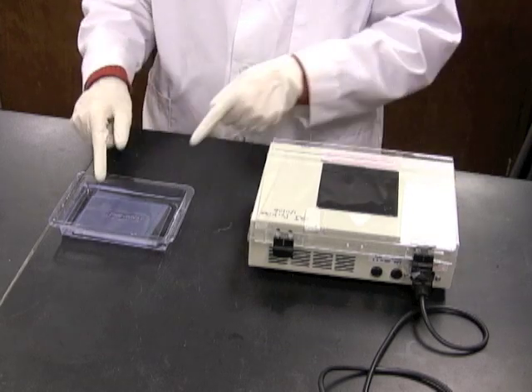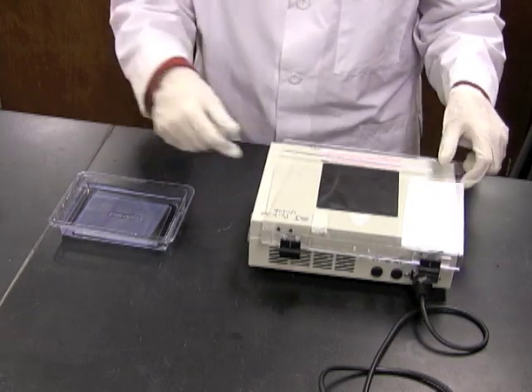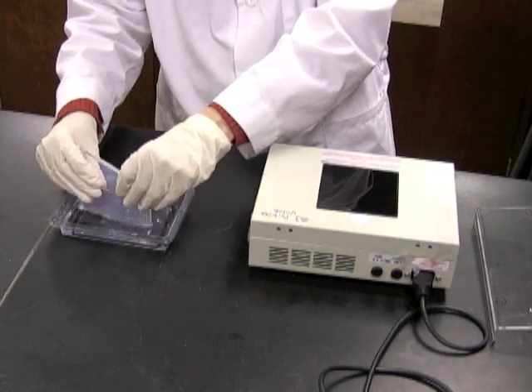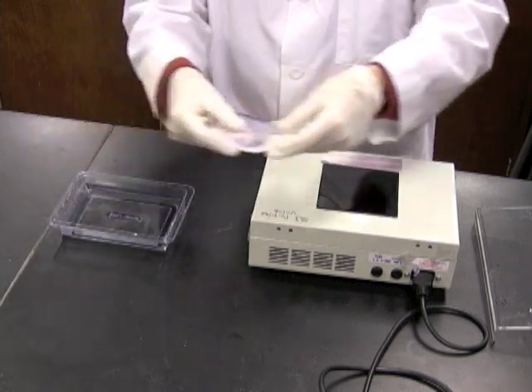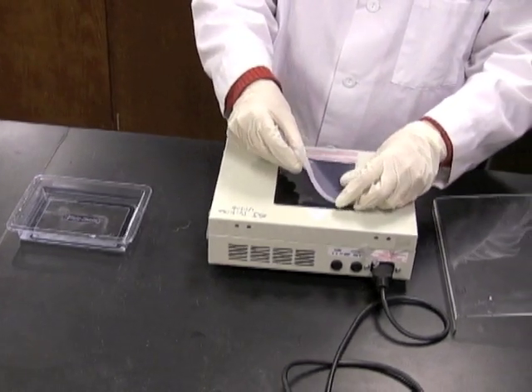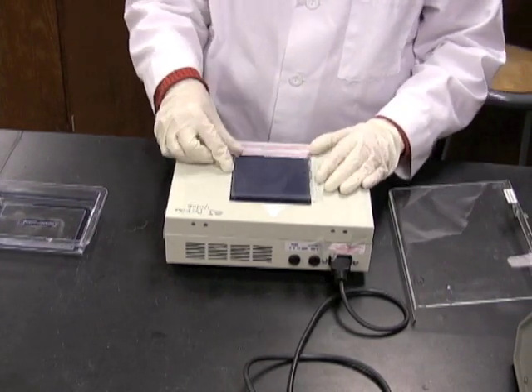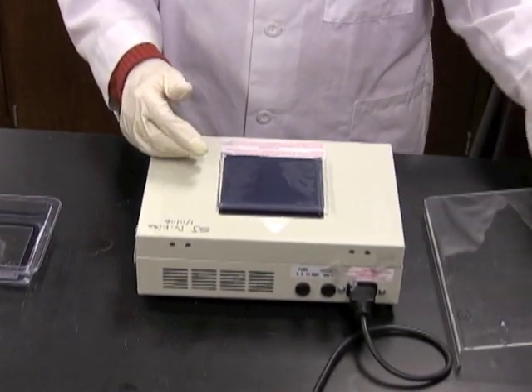So now I'm going to transfer the gel from the staining tray onto the UV light box. And when you put the gel onto the light box, start on one end and then slowly lower the gel. That way you'll avoid bubbles underneath the gel. And before you turn on the UV light box, remember to put the cover back on the light box. And when you turn on the light, what you'll see is fluorescence from wherever the dye has bound to the gel. And you'll see the banding pattern if you have DNA.